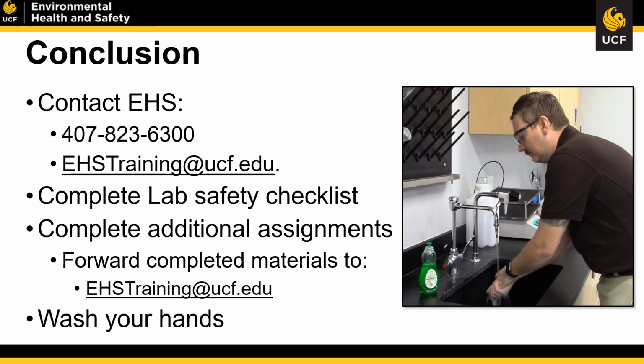As we conclude, please always, always, always, when you leave a lab, wash your hands and remove your lab coat and safety glasses. We want to make sure that your hazards stay within your lab and that you maintain good hygiene practices.